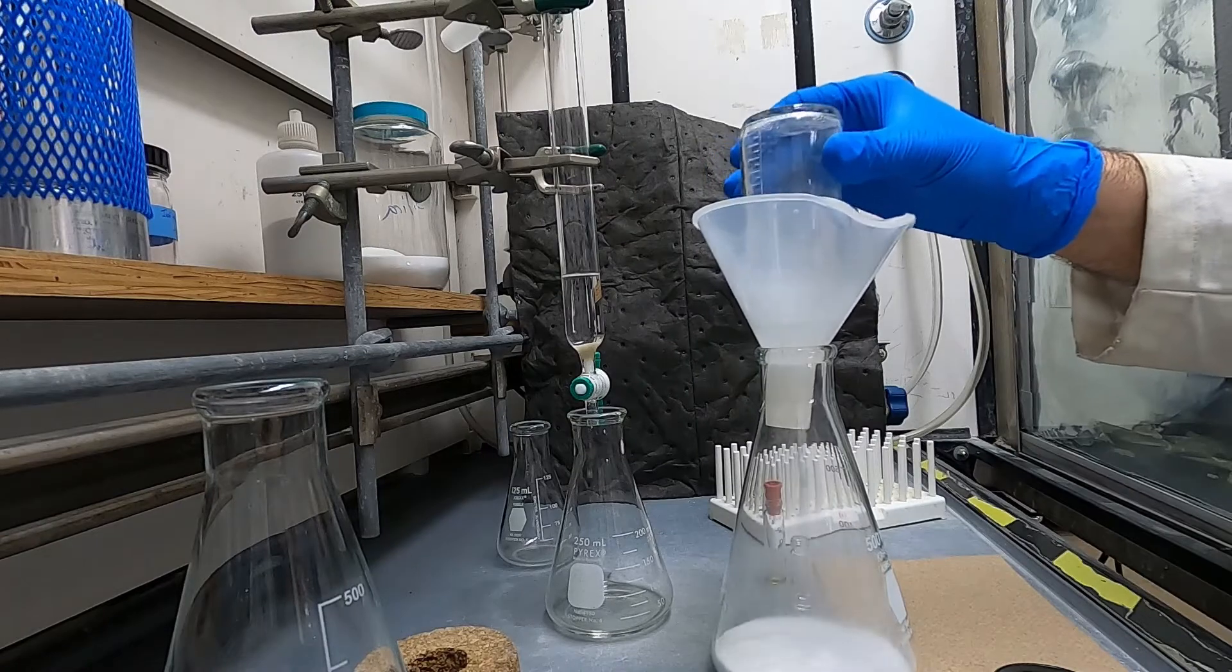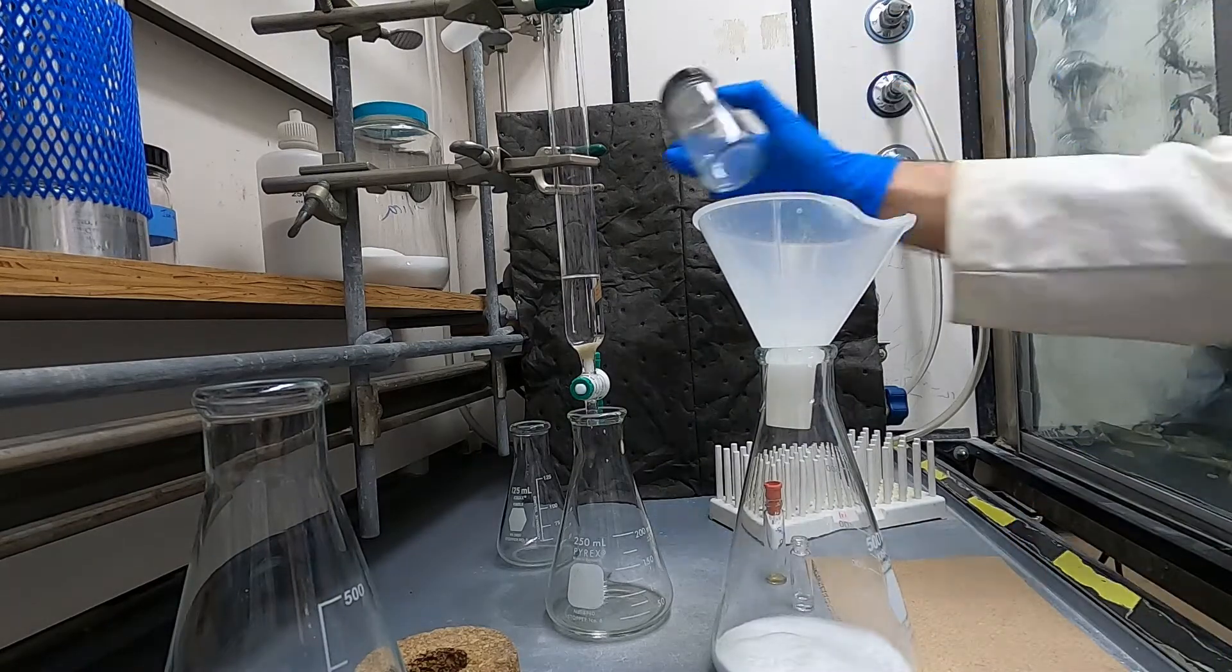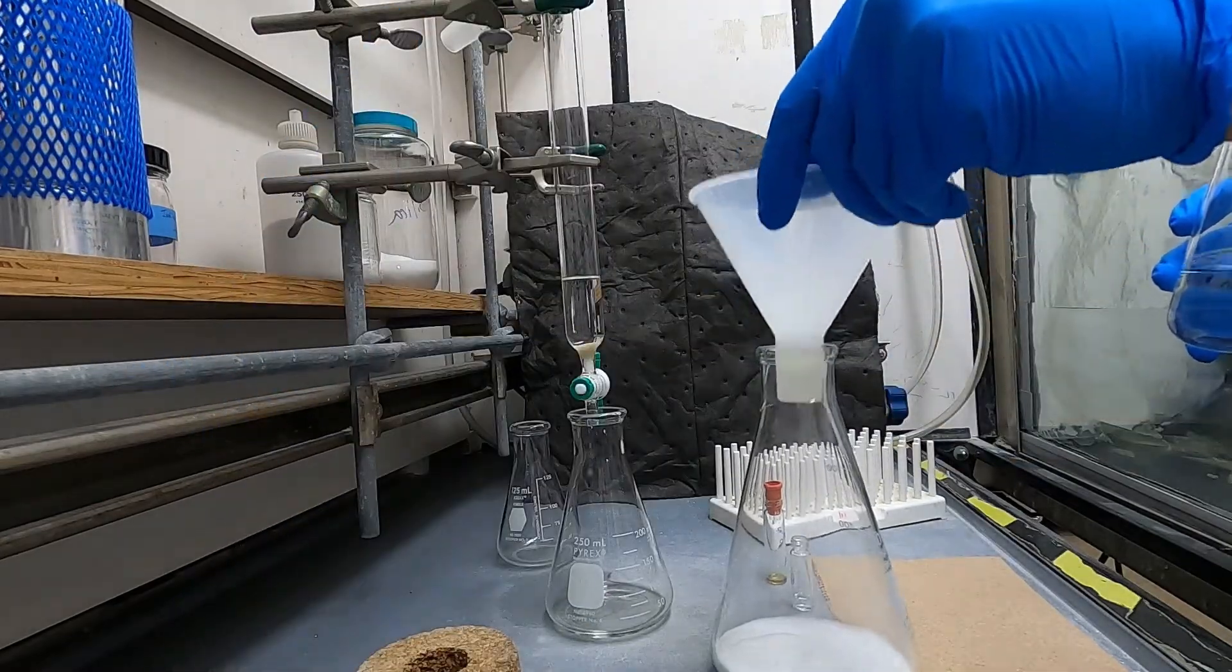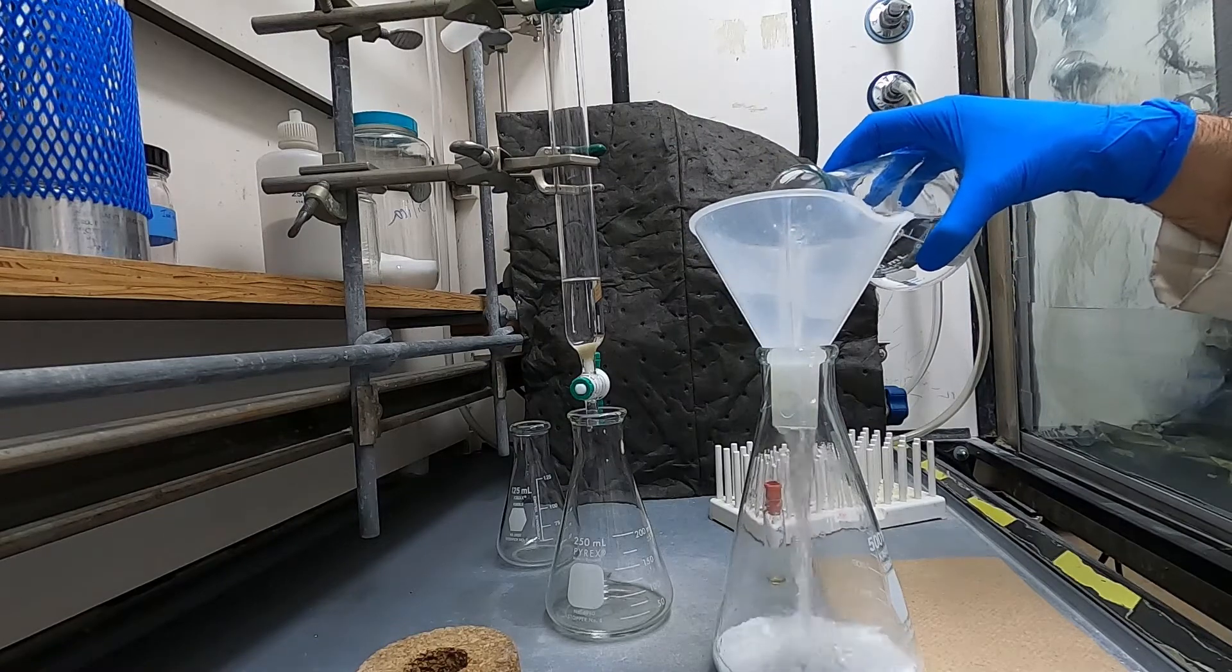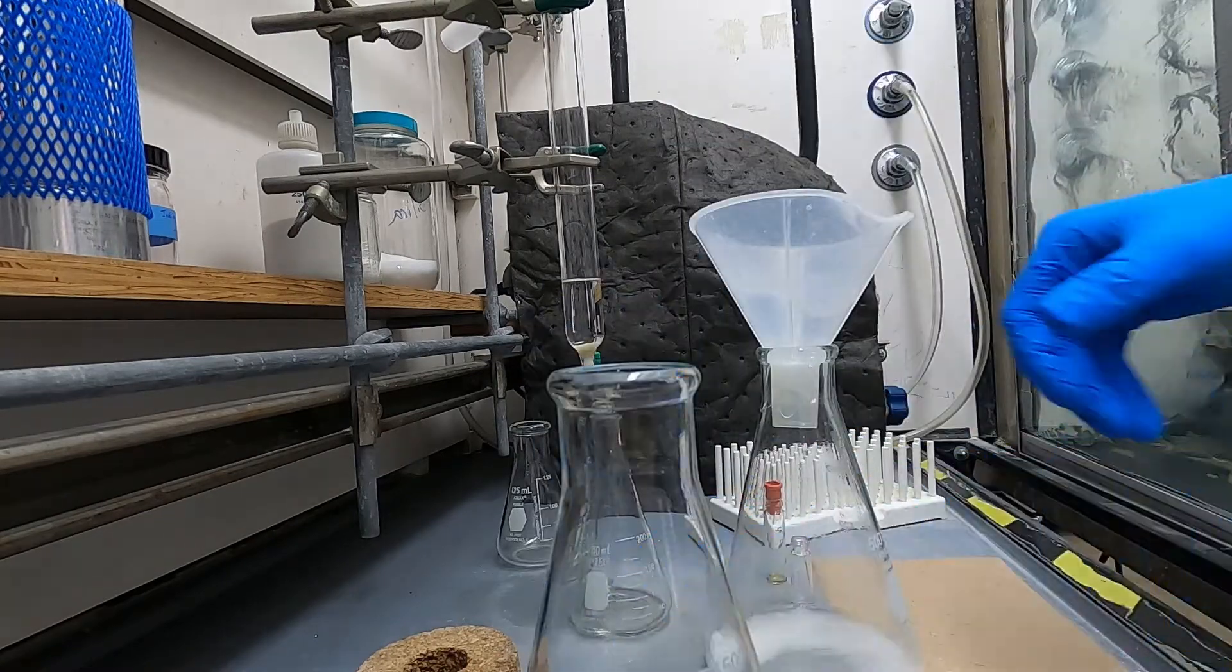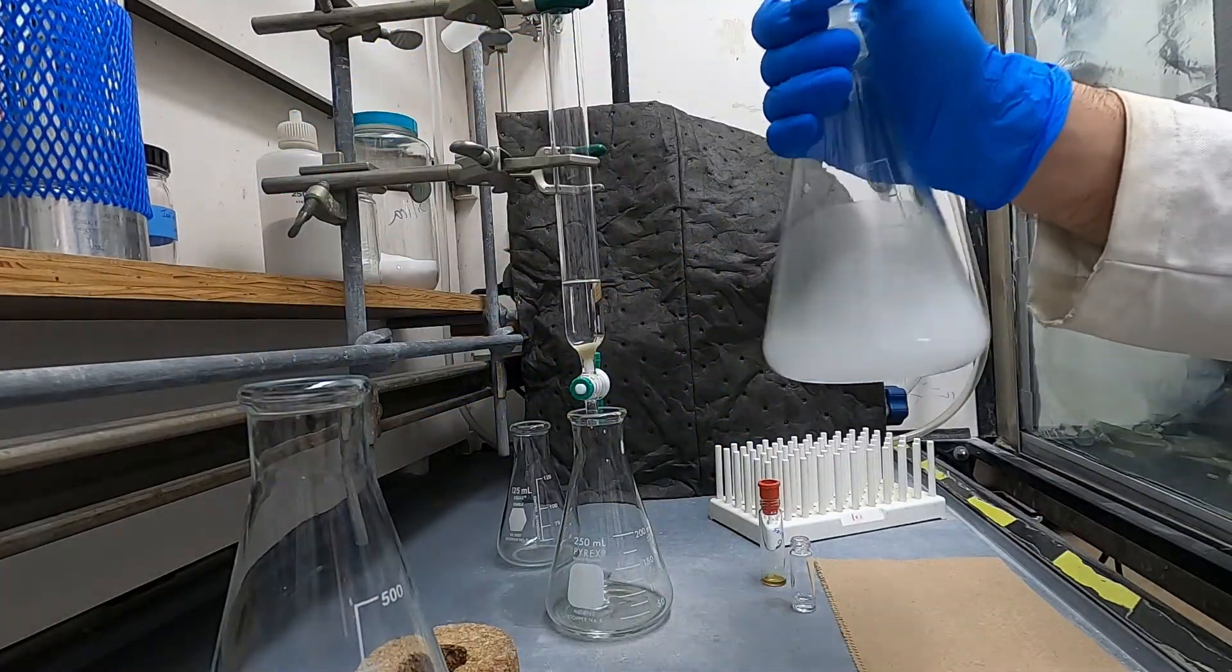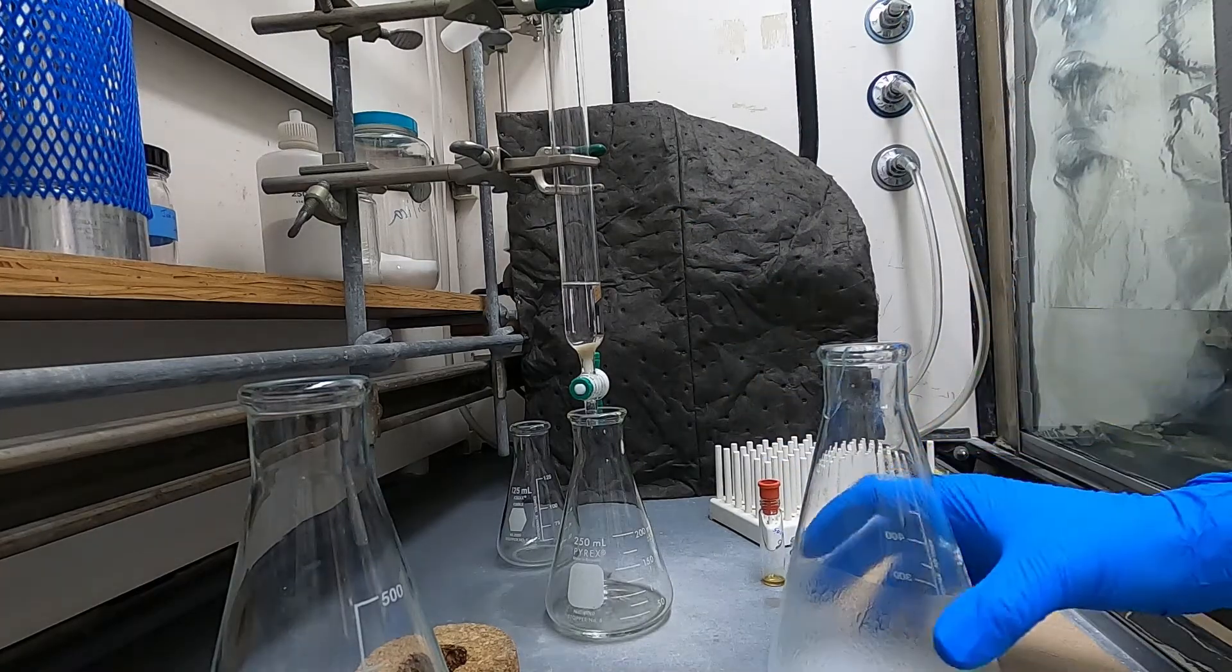So I pour my dry silica into an Erlenmeyer flask and then I will add some of my mobile phase which I've already previously determined a decent mobile phase for this isolation. Add enough so that you can make a slurry with the silica and then you'll add that to the top of your column.